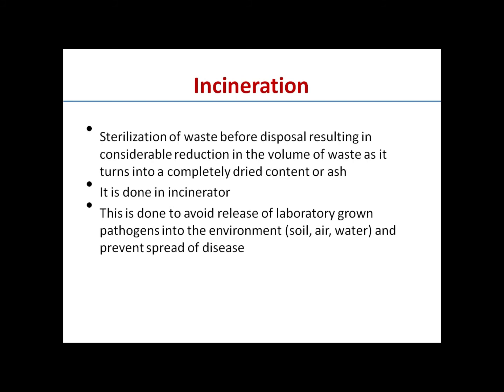In many labs, this is not done. A student or researcher, after working with a pathogen, bacterial or fungal pathogen in the lab, which is multiplied in the lab in the Petri dishes or test tubes, and when the glassware, Petri dishes or test tubes are cleaned, the microbes are thrown in the dustbin.